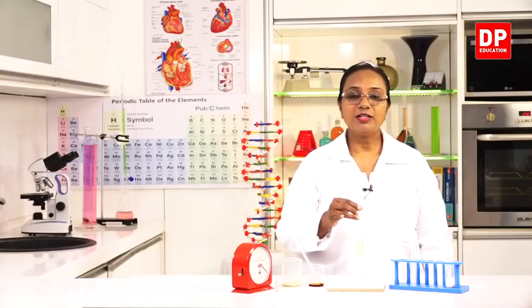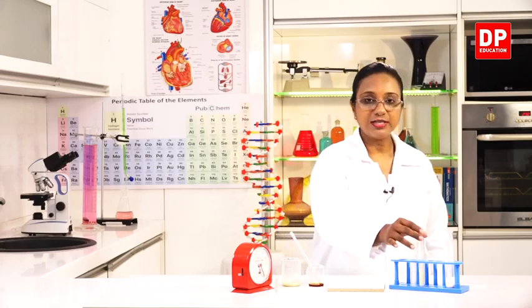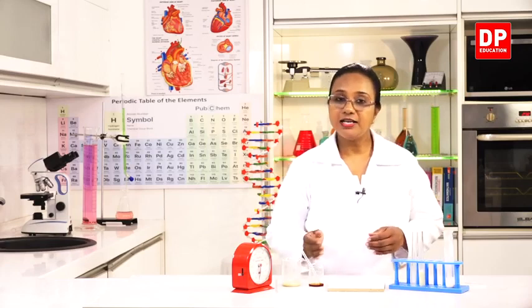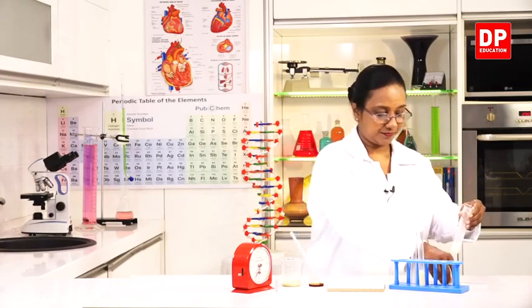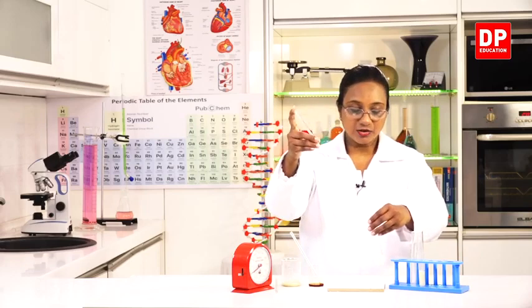While we wait for the first 2 minutes to be over, I will show you all the color change that will take place between starch and iodine. Iodine is the reagent that we are going to use for the testing. So, this is the starch solution that I used.